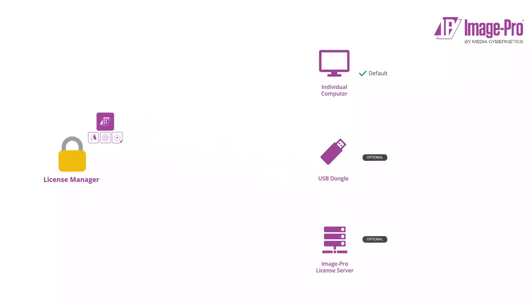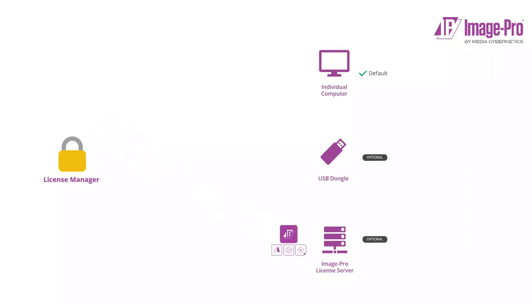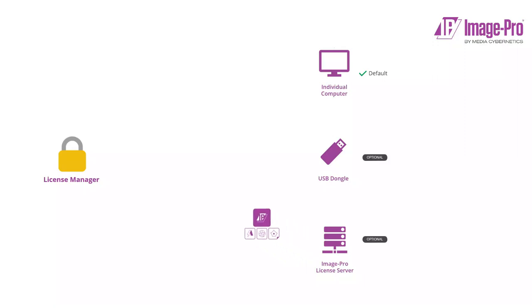When a bundle is linked to a license server, any user of any computer that's connected to the license server is licensed to use ImagePro. Using the license server is covered in another video. In this video, we'll consider linking license bundles to computers and dongles.